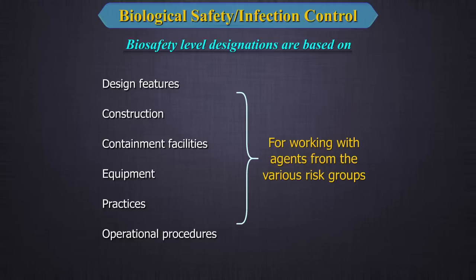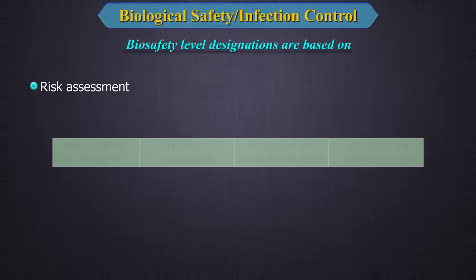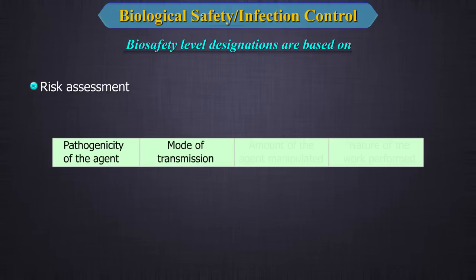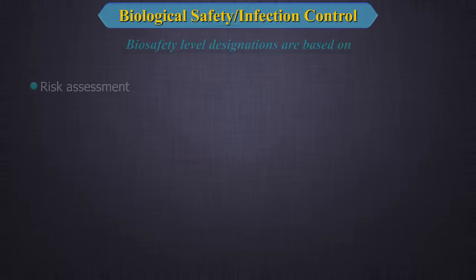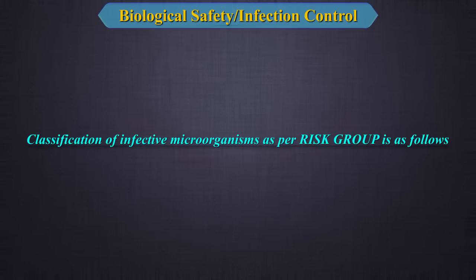And 2. Risk assessment, which evaluates the pathogenicity of the agent, the mode of its transmission, the amount of the agent manipulated, and the nature of the work performed. How do we classify infective microorganisms as per the risk group?